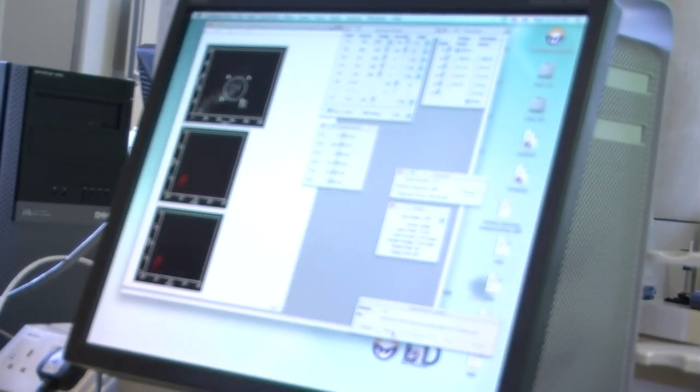And where the red populations are. And again, these look to be in almost exactly the same place. So these cells look far closer in terms of forward and side scatter profile to the last one we did. They're different to the first one. Now, there's probably something you can infer from that.